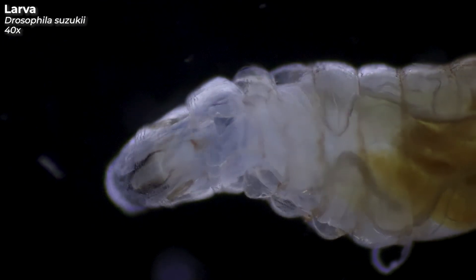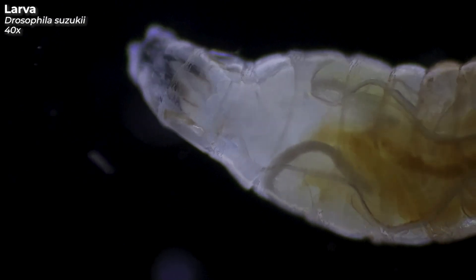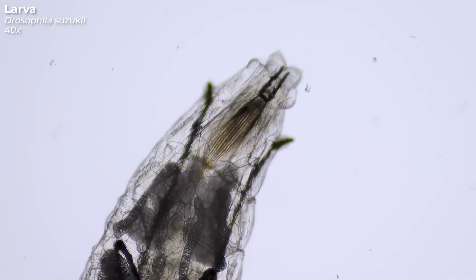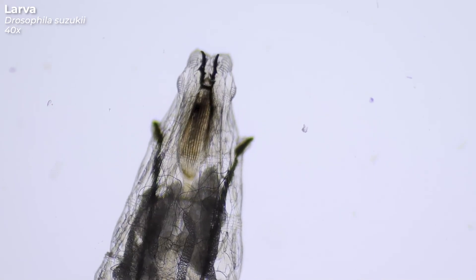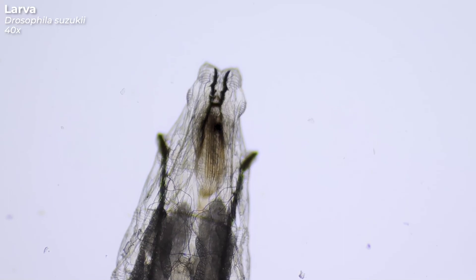The spotted wing Drosophila prefer sweet cherries, but also plums, blueberries, raspberries and other thin-skinned fruits. With its mouth hooks, which are visible here, the larva can munch its way through the flesh very well. The little black arms on both sides are the anterior spiroclos. They allow air to enter its organism, especially when it has pupated.